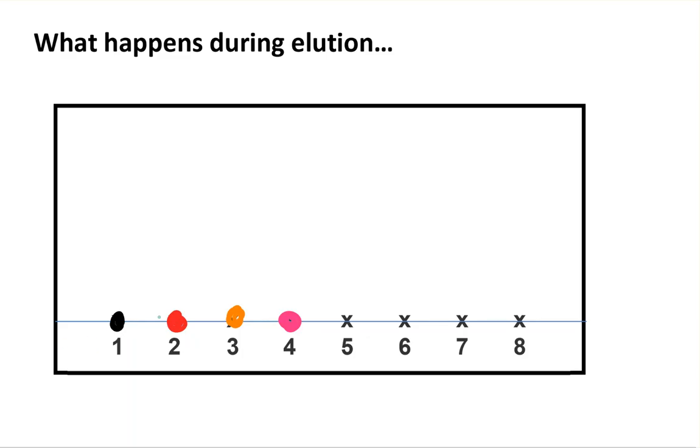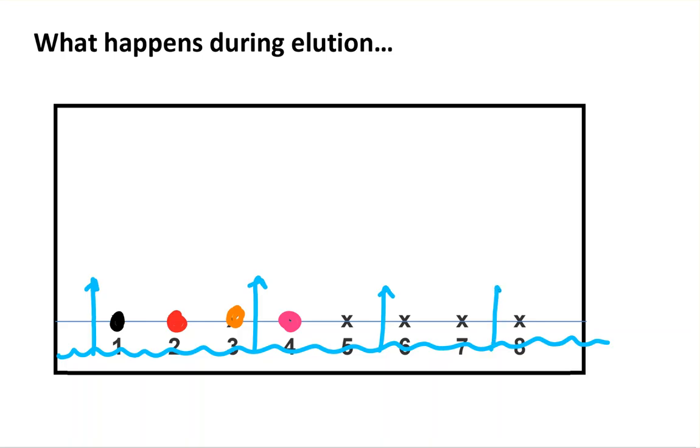And then we dip this dry paper, so this is our chromatography paper, down into our eluting solution, which of course is a liquid, and we don't let that liquid touch these spots, because if it did, it would just wash them down into the liquid. But what starts to happen is that you have paper and a liquid. The liquid starts soaking up, moving up this paper. And eventually, it just keeps moving up. Eventually, it'll end up way up here.